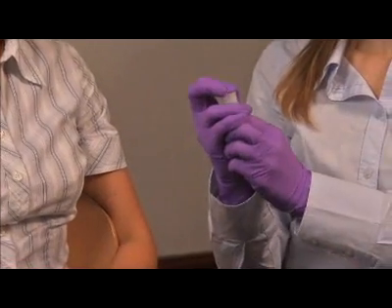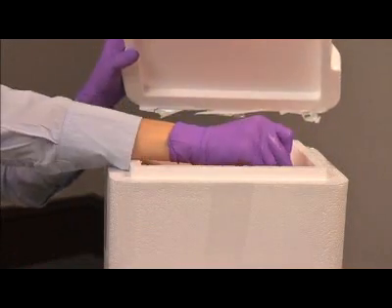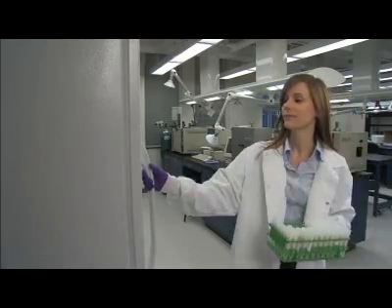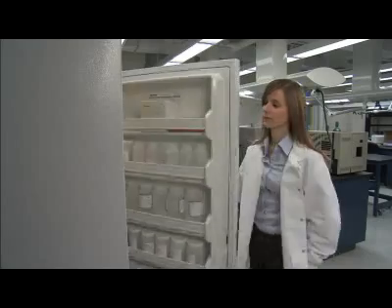Recap the sample tube, ensuring the cap is tightly in place. Place the sample tube in a portable cooler with ice packs for temporary storage and transportation until the end of the collection day. At the end of the day, the saliva samples should be moved to a -20°C freezer, if possible.